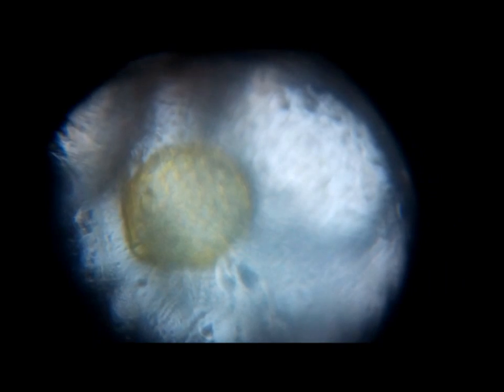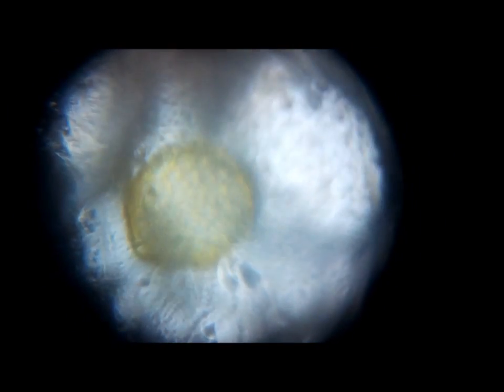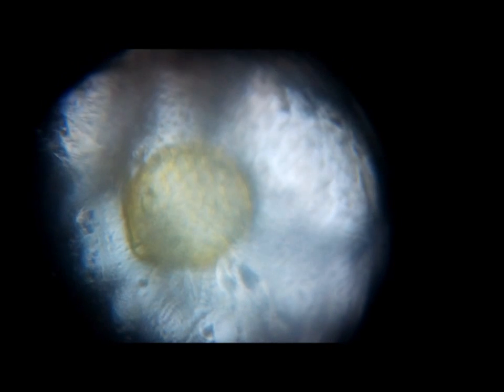So we can see here the round structure of these dicot pollen grains. The slight projection you can see on the upper left end of the pollen grain. It is basically an outgrowth of the exine, the outer layer of the pollen grain.